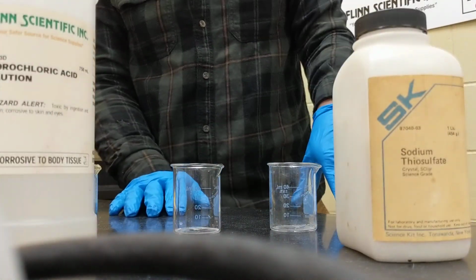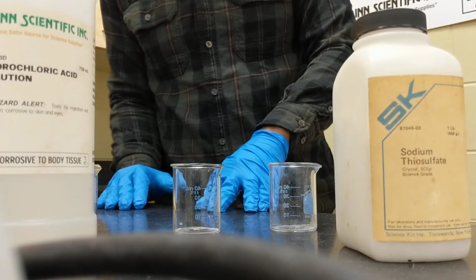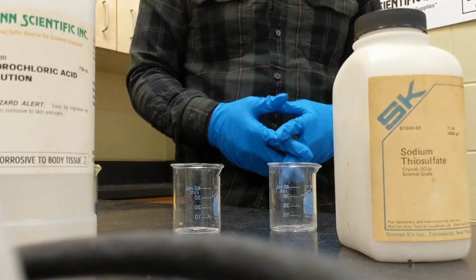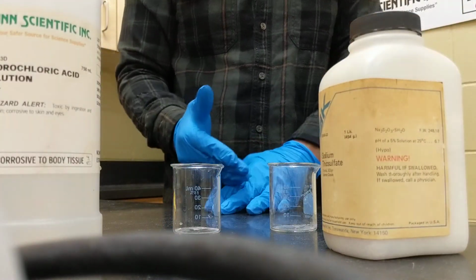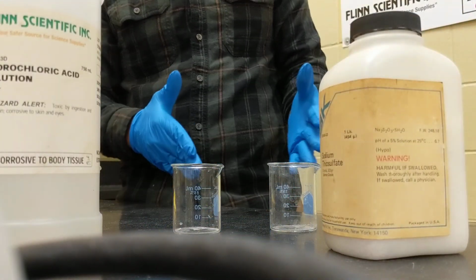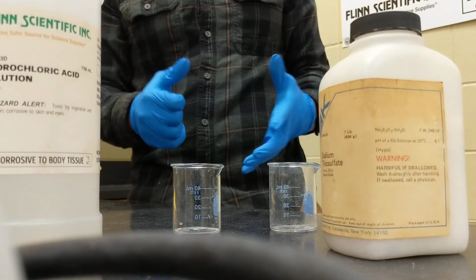Hey guys, and today we're going to explore chemical kinetic reactions. Now this chemical kinetics reaction is going to be a simple demonstration / lab to show how you can determine the rate order of specific reactants in a reaction.